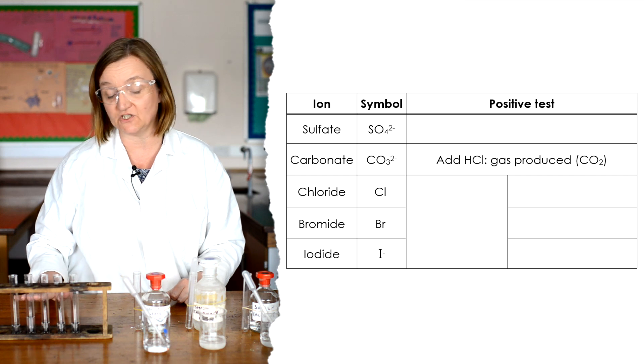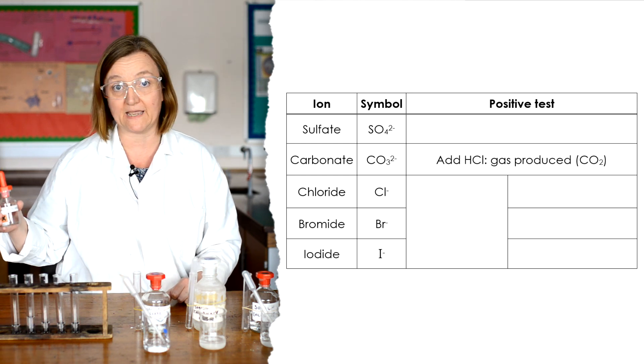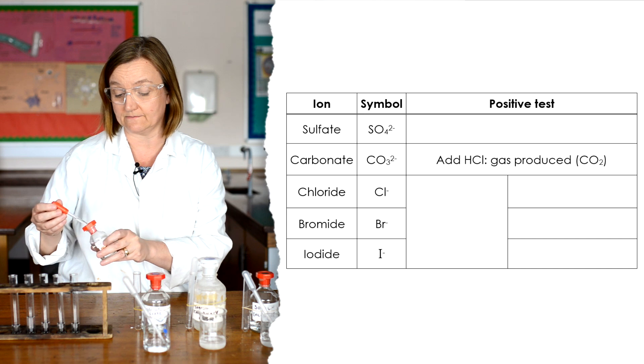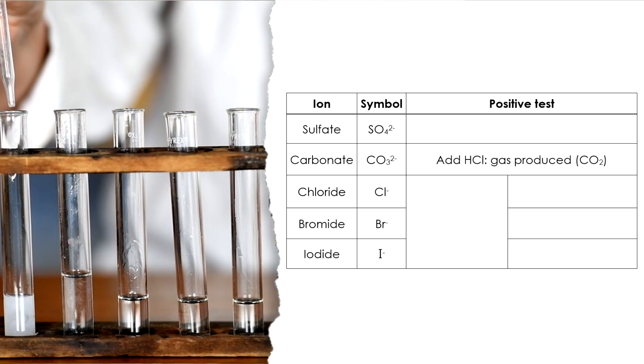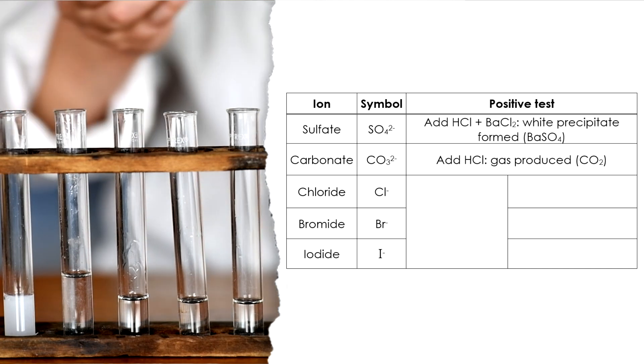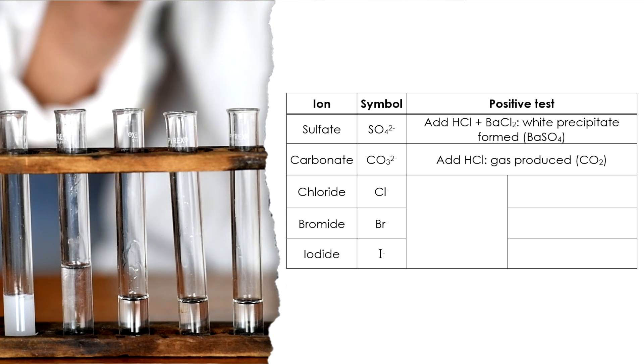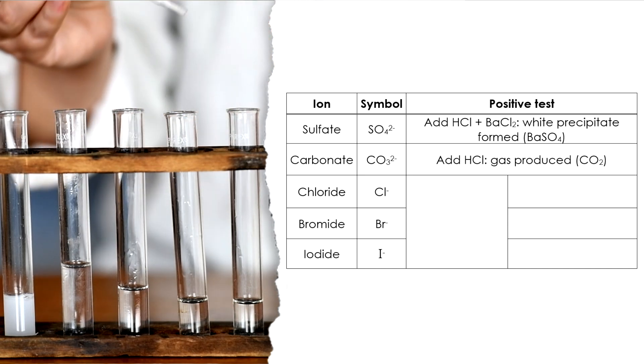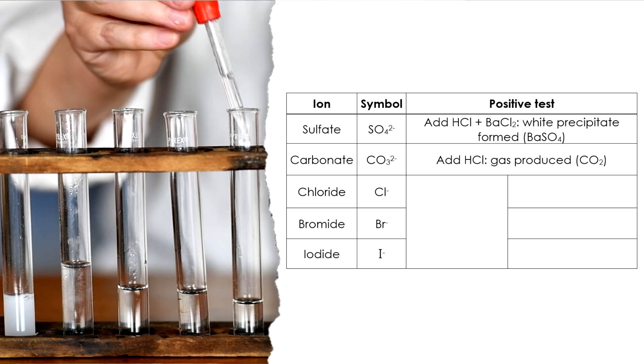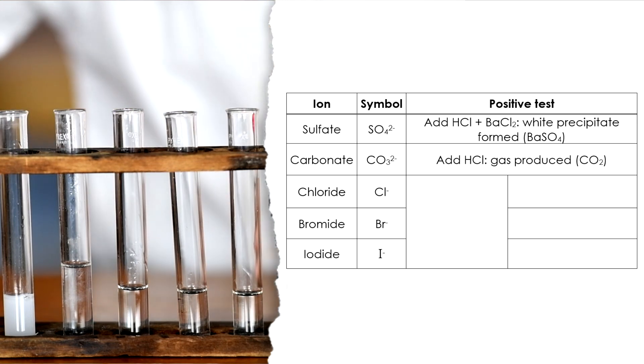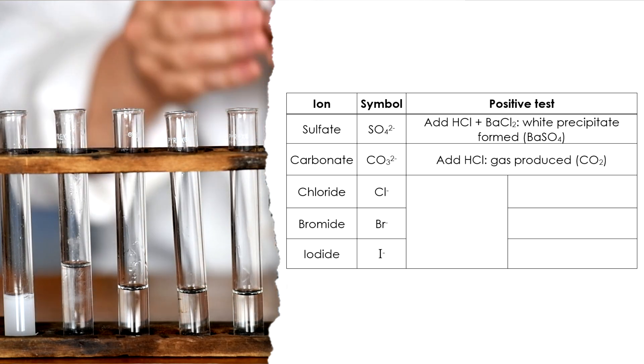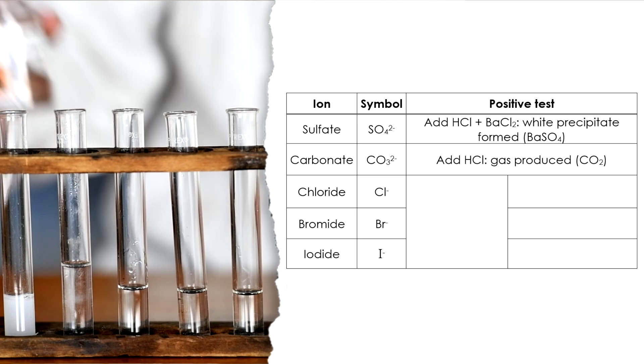Now we can do the next test straight away. We don't have to change anything because I'm now going to test them all with barium chloride. I've already put the hydrochloric acid in, but now let's see what happens when I add barium chloride. So into sulfate, a white precipitate forms immediately of barium sulfate. Into the carbonate, no change. Into the chloride, no change. Into the bromide, no change. Into the iodide, no change. So where hydrochloric acid on its own can be used as a test for carbonate ions, we saw the fizzing, following hydrochloric acid with barium chloride can be used as a test for sulfate ions, and we get the white, insoluble precipitate of barium sulfate formed.